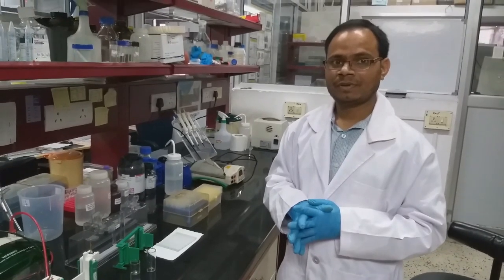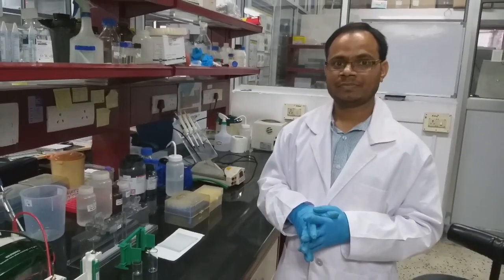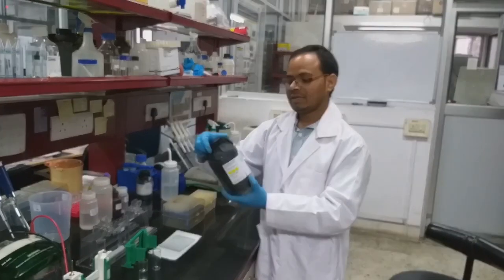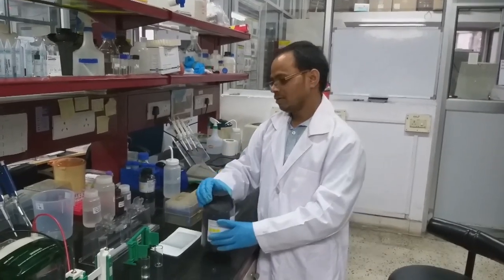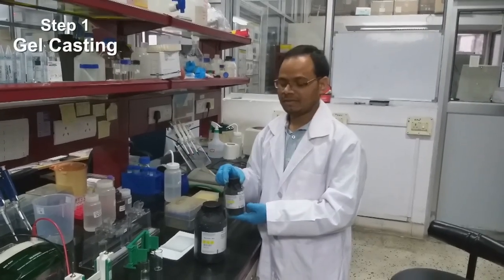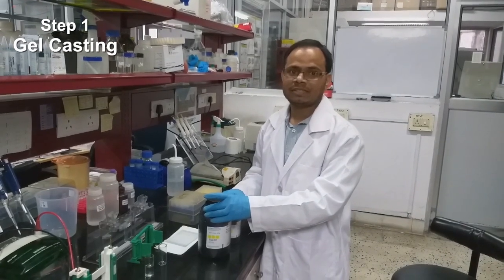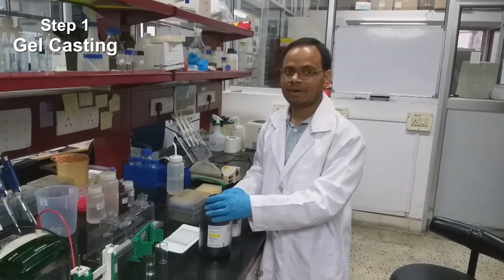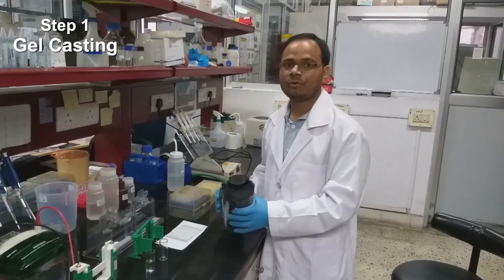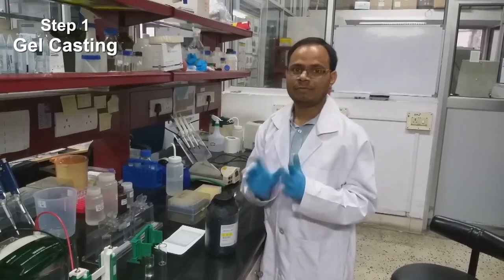acrylamide. Generally we prepare 30% acrylamide. 30% means 29 grams of acrylamide and 1 gram of bisacrylamide, used in a 29:1 ratio in 100 ml of water to get 30% acrylamide. Both of these are neurotoxic, so we always have to wear gloves.